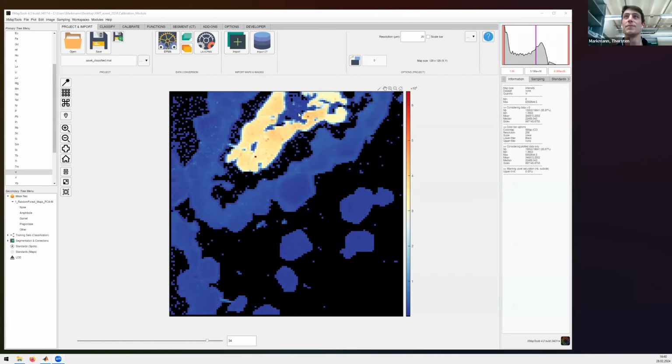Thank you again, Pierre. What I'm trying to do is follow the nitty-gritty steps between the maps of intensity and the calibrated, quantified maps we want to get from the map we have been acquiring on the garnet and the plagioclase.